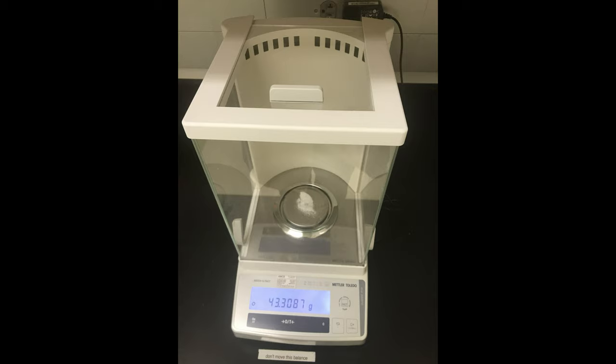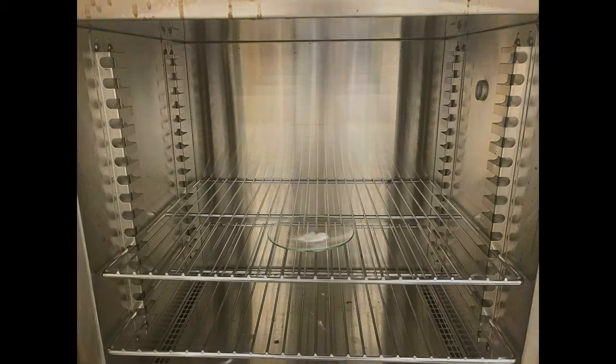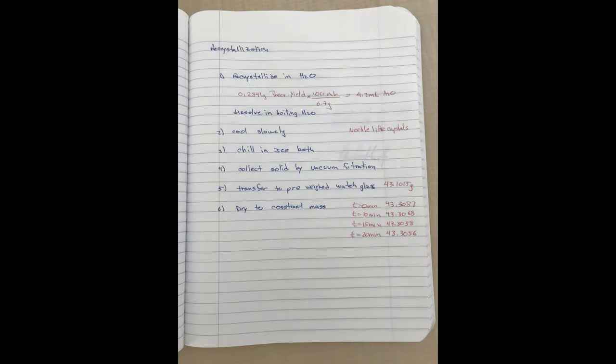I weigh my crystals on the balance. Put them in the oven to dry, and then I will reweigh them after 5 or 10 minutes and keep on doing that cycle till they're dry. After 20 minutes, I have a mass of 43.3056.